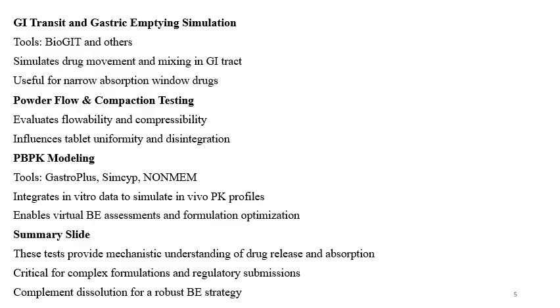GI transit and gastric emptying simulations. Different tools like BioGIT can be used to simulate the drug movement and mixing in the GI tract. It is useful for narrow absorption window drugs. Powder flow and compaction testing. These are also sometimes tested for formulations like tablets.